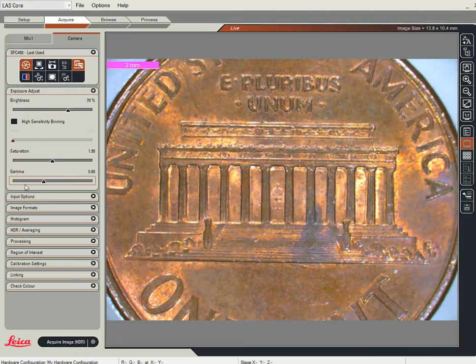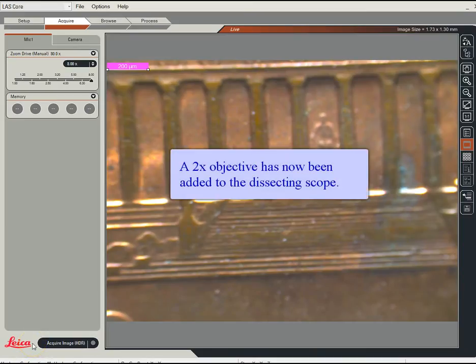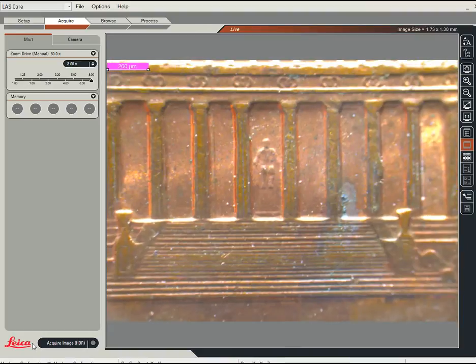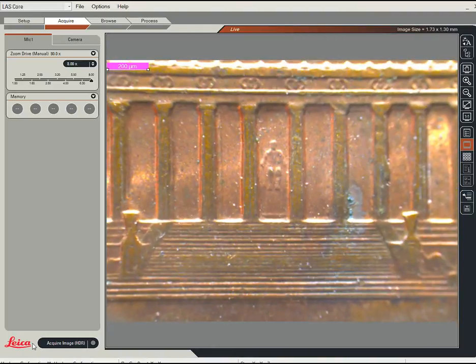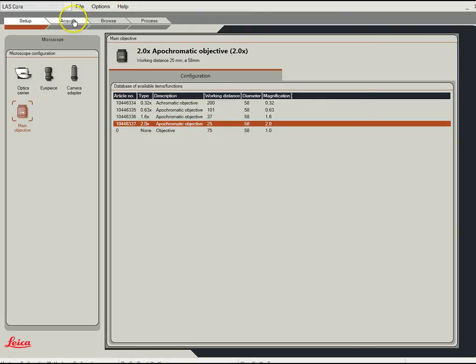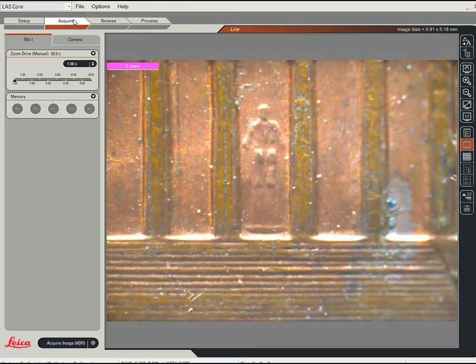Now what we're going to do is add a different objective lens. So back to my setup — I'm going to add the objective and tell it it's a 2x lens. Go back to Acquire. Now I'm going to zoom in all the way and this time you'll notice we can go a lot further — twice as high. Also, there's a little bit of lag in the camera, so just be patient and make little moves.